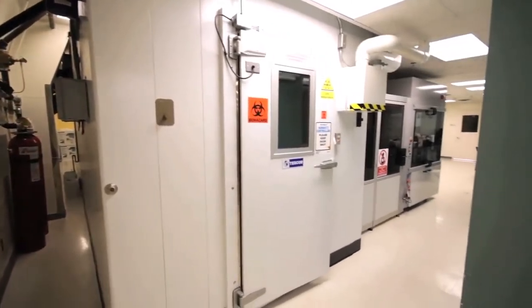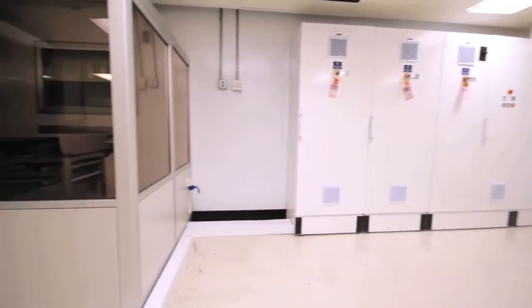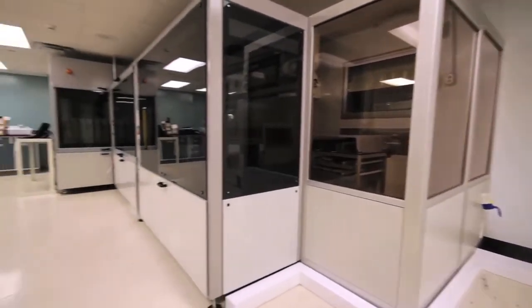This system is designed for a footprint of approximately 41 feet long by 21 feet deep by 9.5 feet tall.